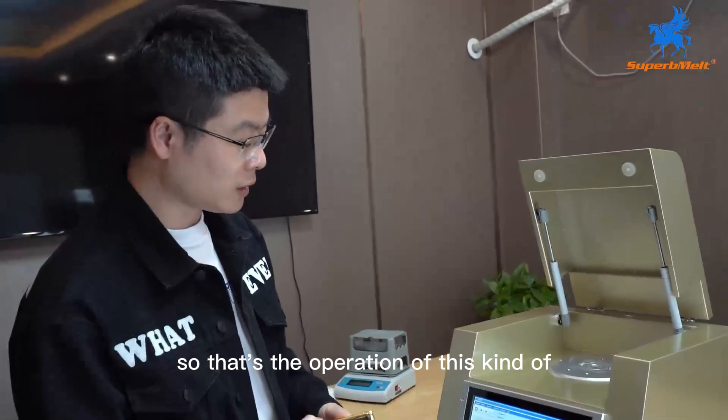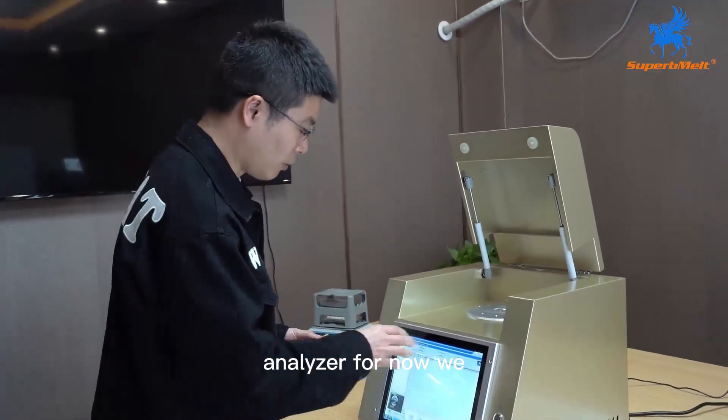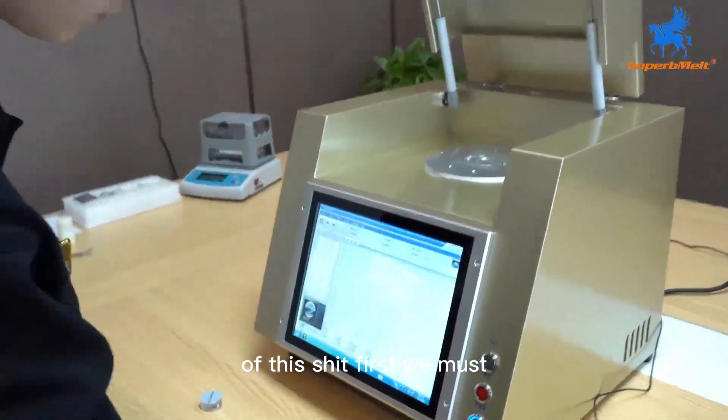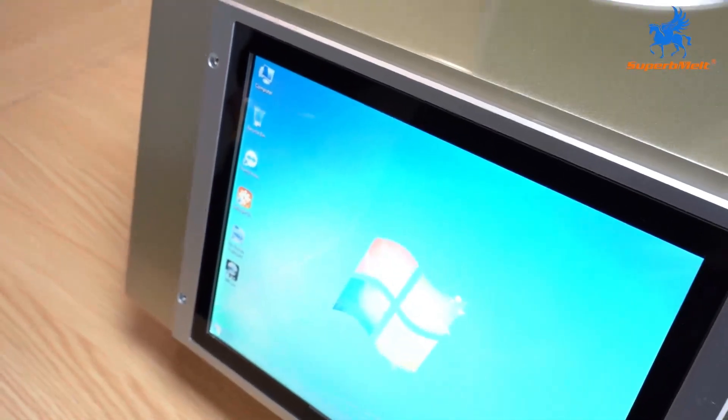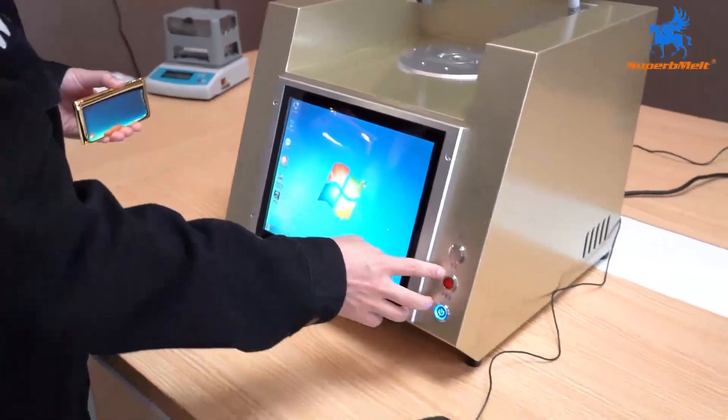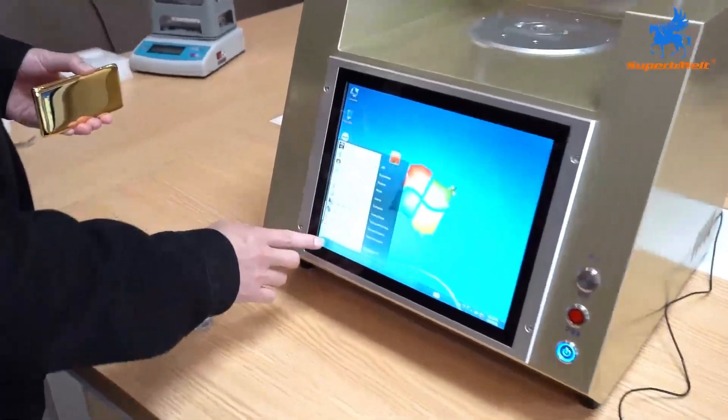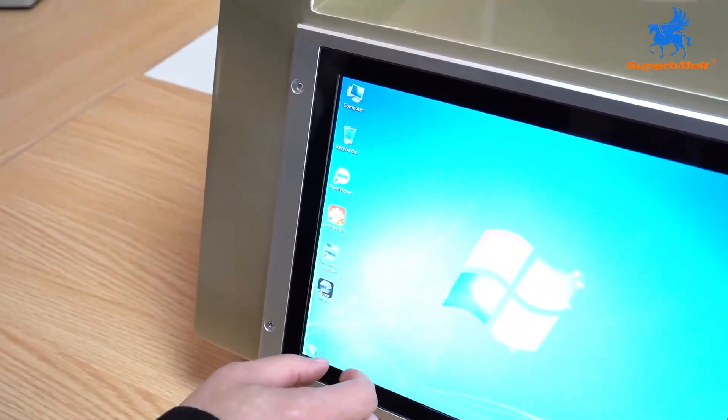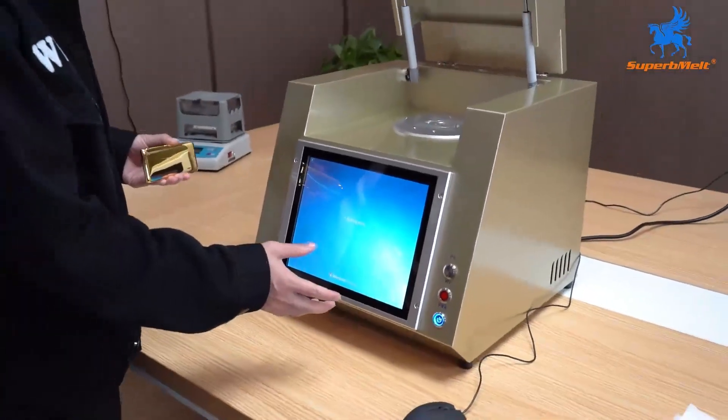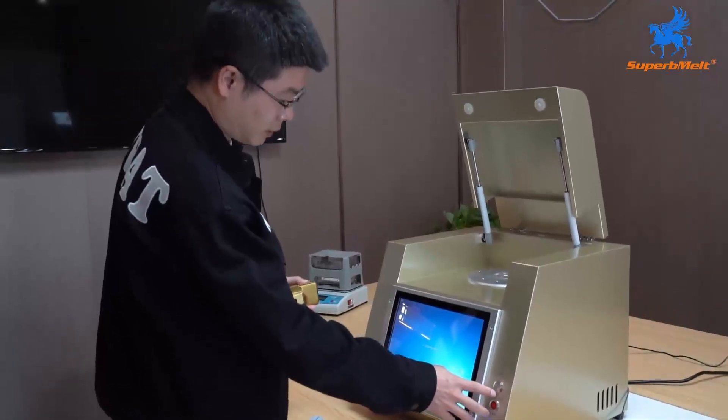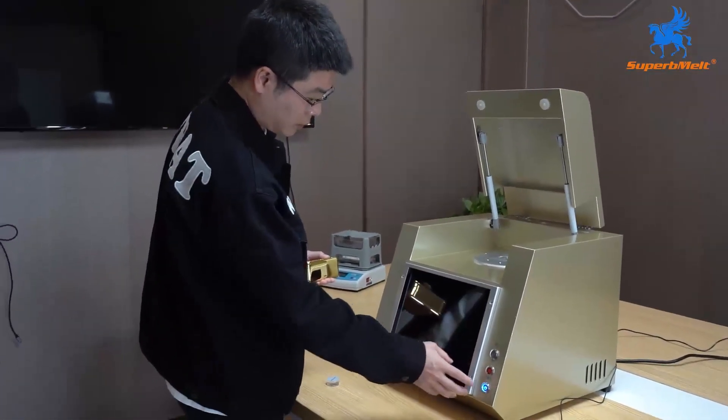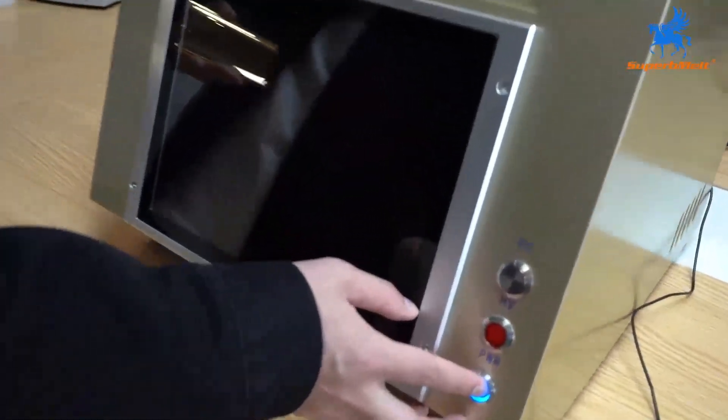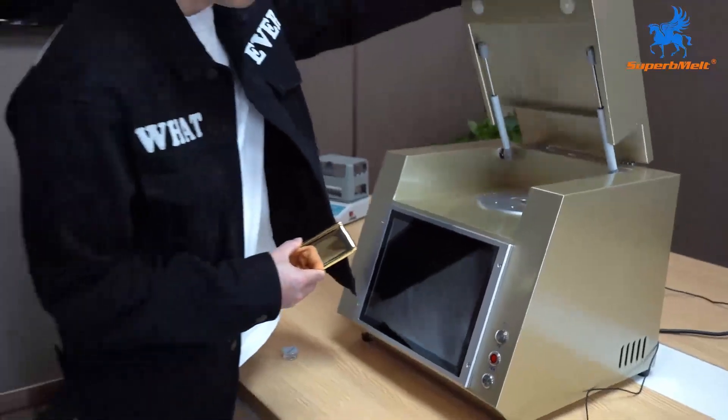That's the operation of this kind of analyzer. Now we move the machine first. We must quit the software and turn off here and turn off, shut down. Software we have already turned off. We press power off. That's the whole process.